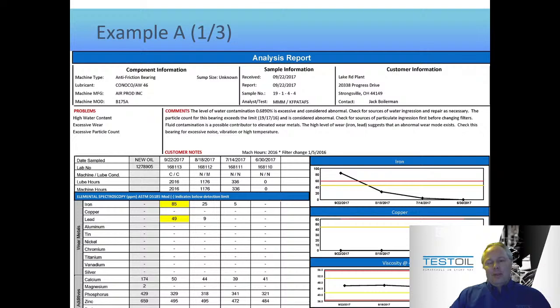There's the make, the model of the bearing. Moving over to the right, there's the date the sample was submitted and the date this report went out. And then of course we've got our customer name way at the far right. I always encourage people, and it sounds like I'm joking, but I say read it. Check to make sure it's your report, because if you're not, well, you'd be done already. But in all seriousness, read it to make sure you know exactly which location this is coming from, because many of our customers monitor multiple locations, and that's where the location would be given, right? So you know exactly which plant, which facility it's coming from. And seriously, it only takes you about half a second of glancing to go, yeah, that's me.